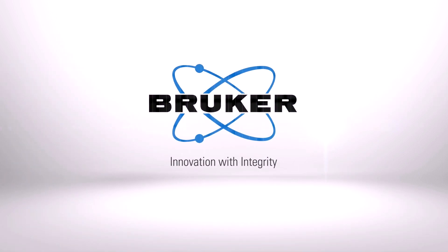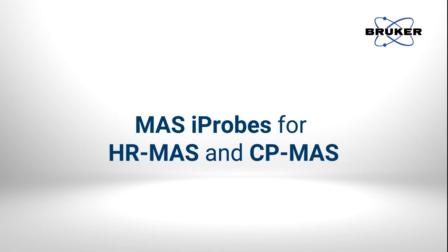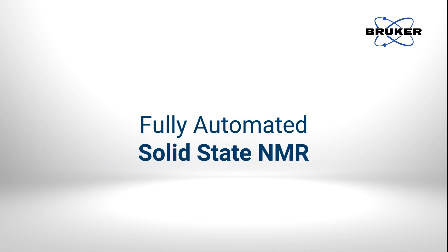With Magic Angle Spinning iProbes for HR MAS and CP MAS, Bruker now enables fully automated solid-state NMR.